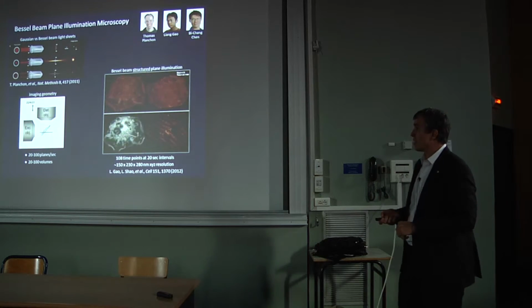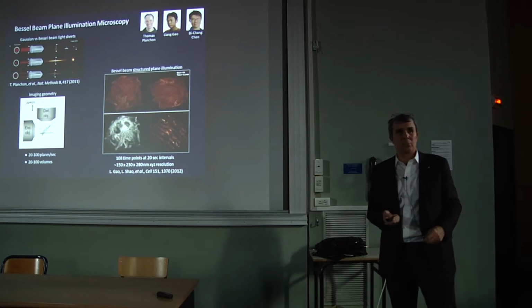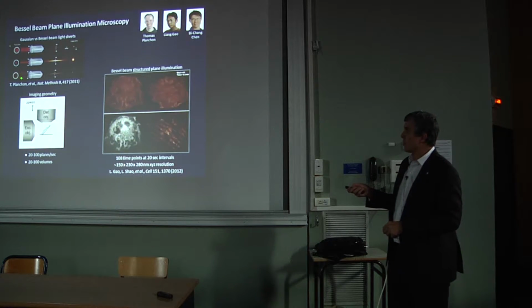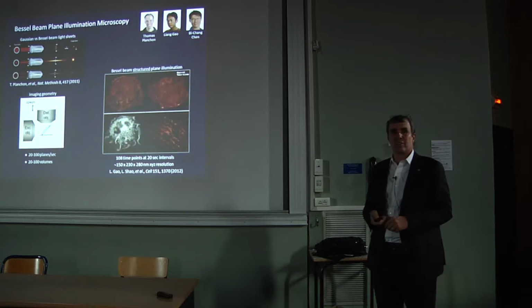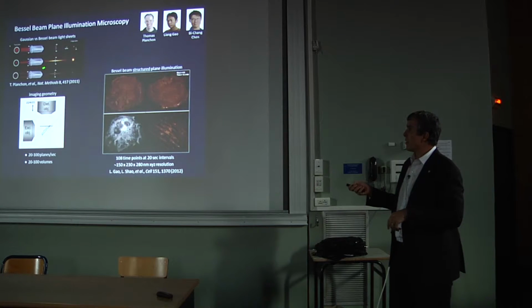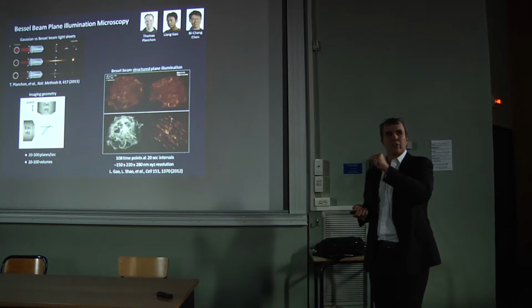So a number of years ago, we started to play with non-diffracting beams to create these light sheets, particularly using a Bessel beam. So in a Bessel beam, you illuminate your lens not uniformly like when you're going to create a Gaussian beam, but instead with an annulus of light. And now you have two knobs to tweak, the diameter of the annulus and the thickness of the annulus. And that allows you to decouple the length of the beam from the diameter of the beam.